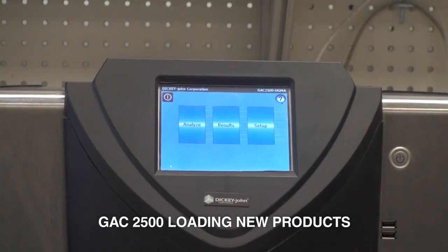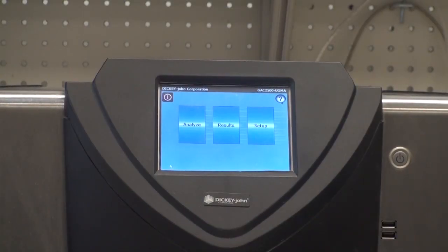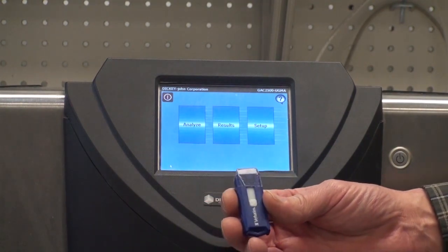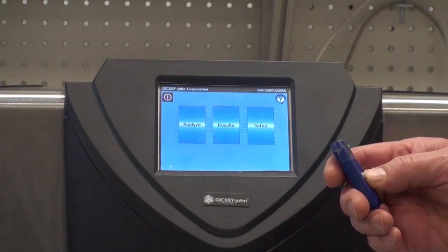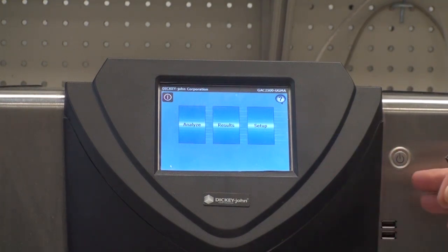Today we're going to go through the process of loading a single product calibration onto the GAC 2500 UGMA, and also loading multiple product calibrations onto the GAC 2500 UGMA. To do that you would need a USB drive with the calibrations loaded on it. I will insert that at the appropriate time.